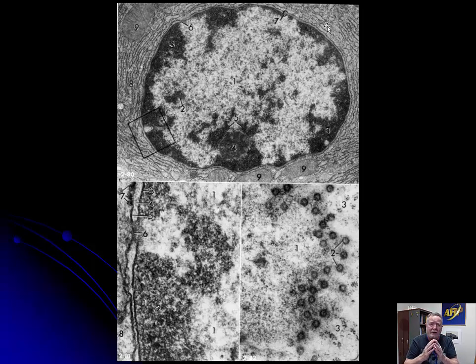And if you think about it, if you have a cell with a nucleus in the middle, if you cut it at the edge of the cell, the nucleus is going to be much smaller than if you cut straight through the center of the cell. So the size of a nucleus is often very dependent upon the sectioning, how tangential you are. And so calling a nucleus small versus large really has no meaning unless you know, which you never do, that you're getting a slice right through the center of the cell.